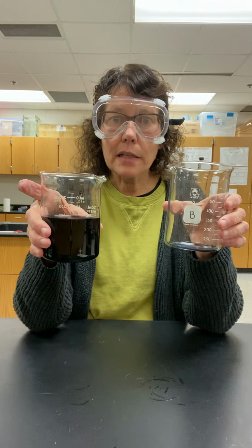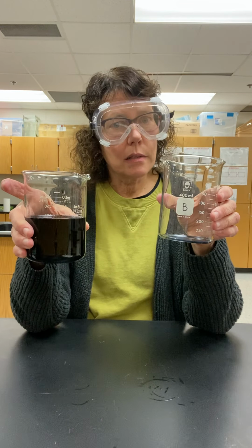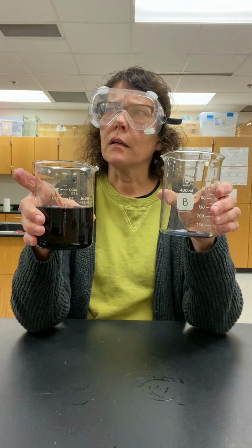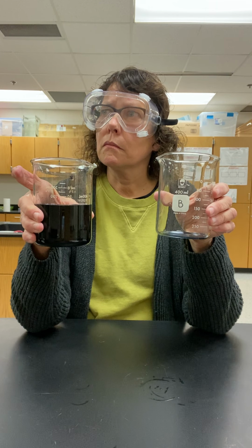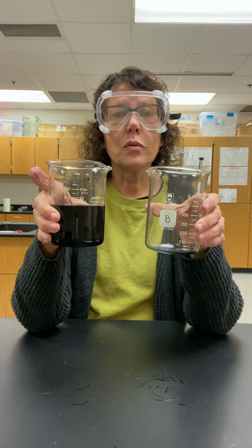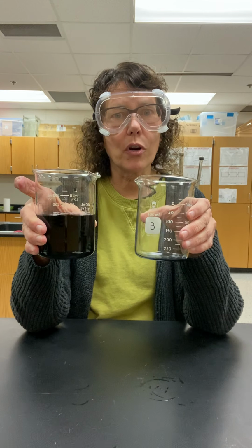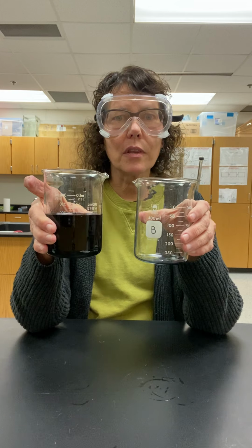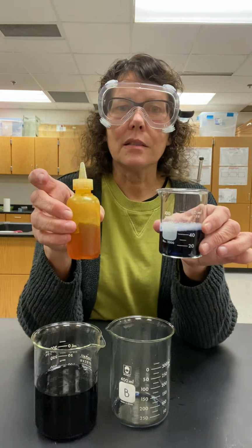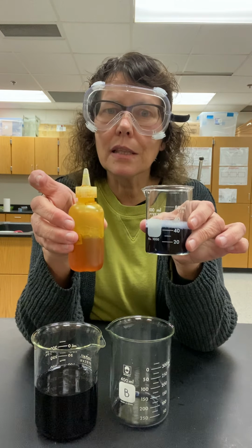Well, there was iodine in one solution, there was starch in the other, but don't forget there was potassium and sulfate and sodium in these, and those other parts of those solutions were reacting with each other first. So it wasn't until those other things were used up that the iodine and the starch were left free to react with each other. And the instant that happened, the solution changes color.